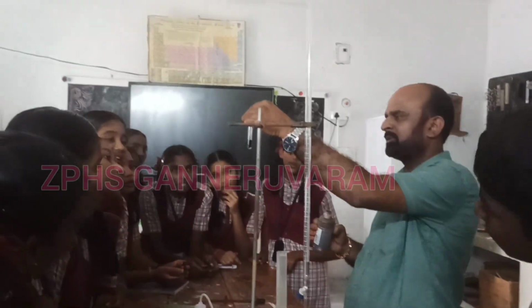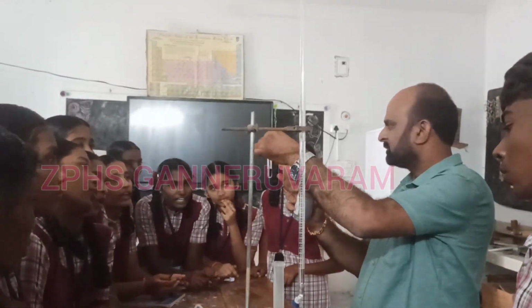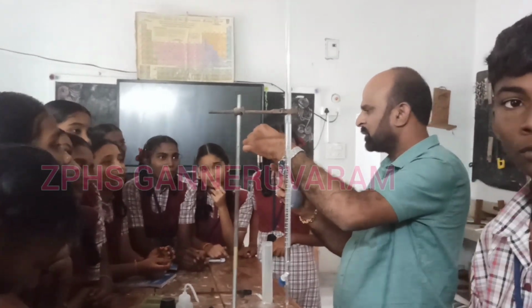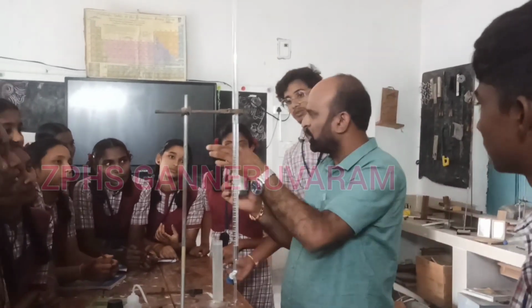What color? Blue color. What solution have I taken in this test tube? Sodium hydroxide solution. Sodium hydroxide solution turns red litmus to blue color.